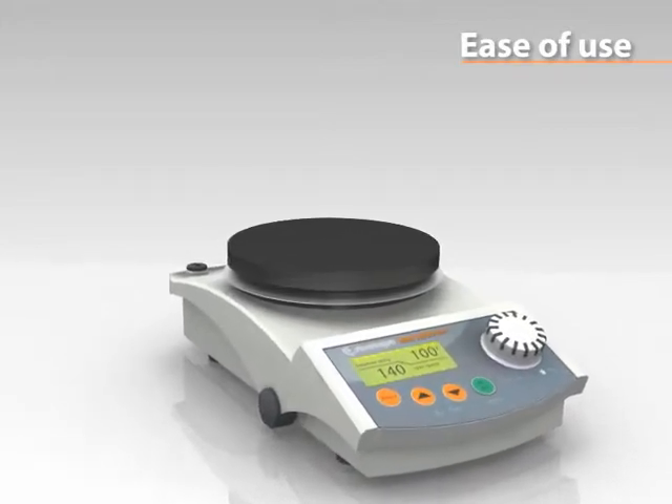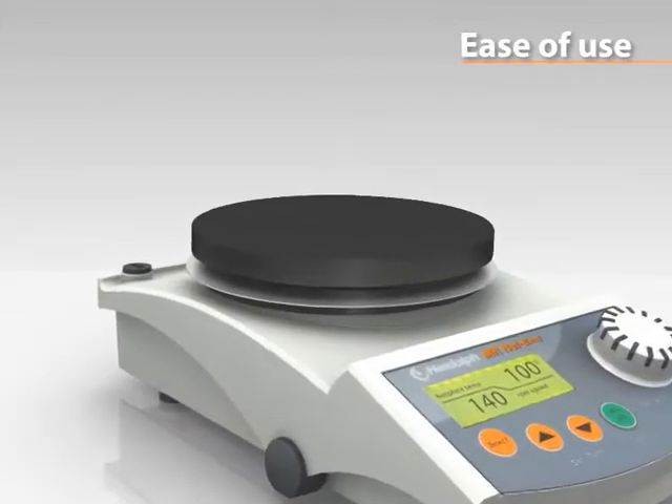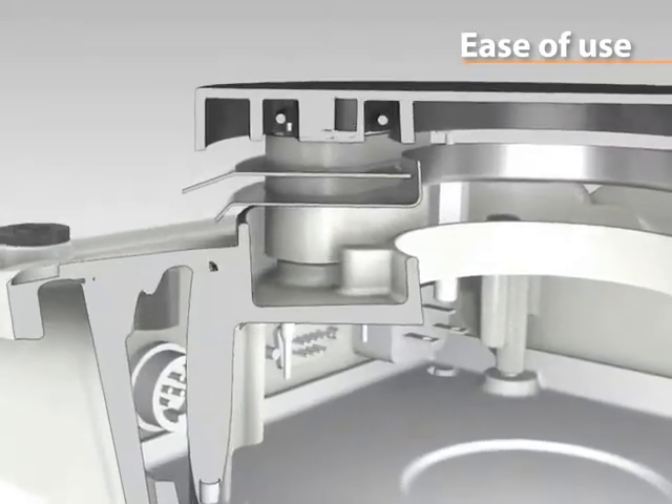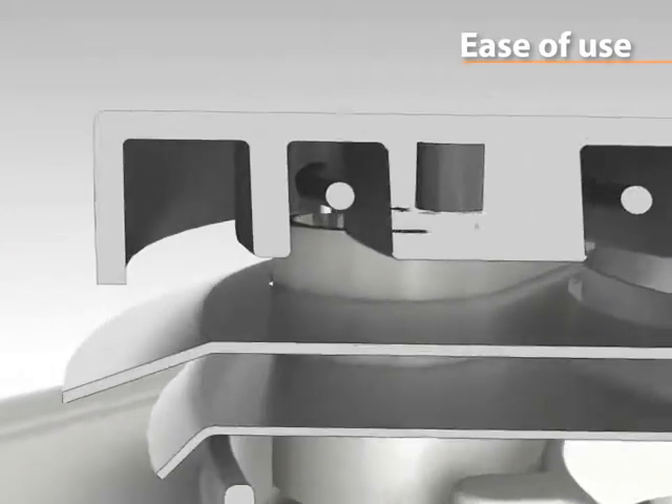The aluminium top plate allows for immediate heat transfer for quick heat-up times. A thin layer of ceramic coating makes the top plates chemically resistant and scratch-proof.